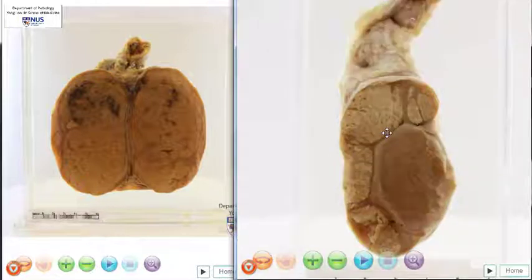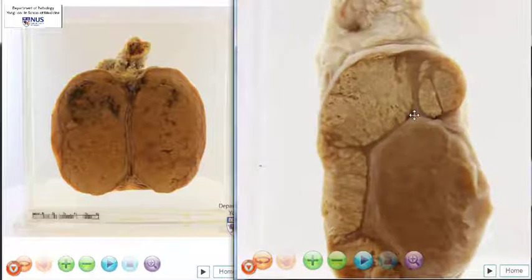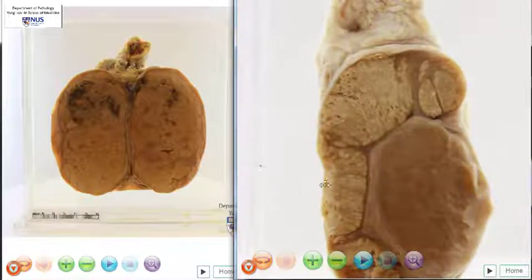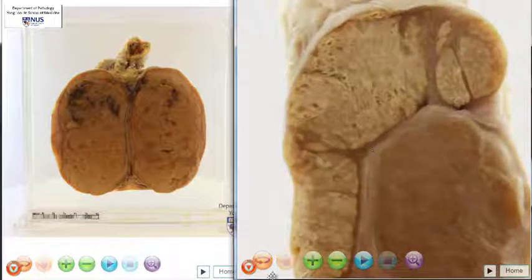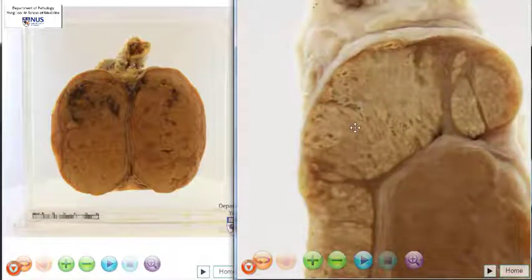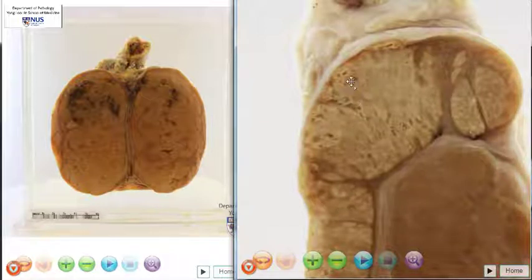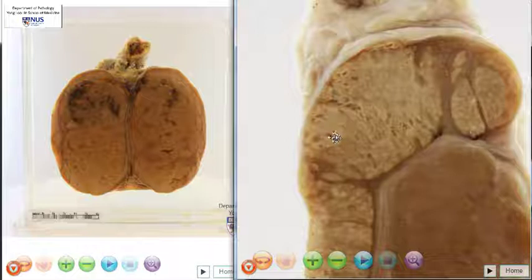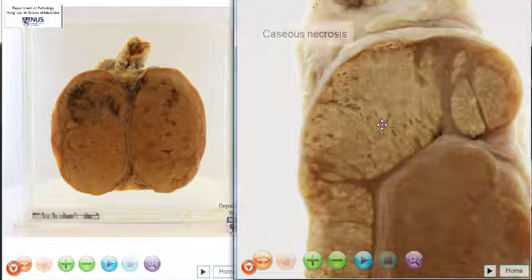Now in this specimen, the immediate abnormality is obviously seen in the epididymis. What's happening is that it is expanded and it's got this discolouration — almost a cheesy appearance grossly with some little small holes here, or almost like cavities. Things appear to have fallen out from here. This is a classical appearance of caseous necrosis, as seen in other organs, and this is associated with tuberculosis.